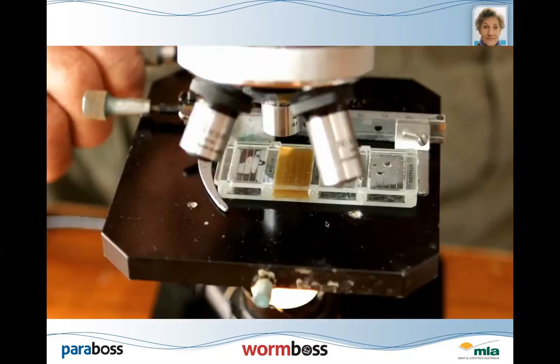That goes on the microscope, and then he has a look down the microscope to look for the worm eggs. Now, as you see, this one's a Whitlock slide, but some people use other types of slides. But it has a chamber in there where the liquid from the sample goes in underneath between two pieces of glass, and there's actually these little runways on the slide, and the lab technicians or yourself will count up and down these little runways until they've got a final egg count.